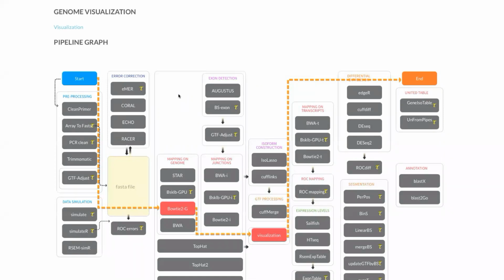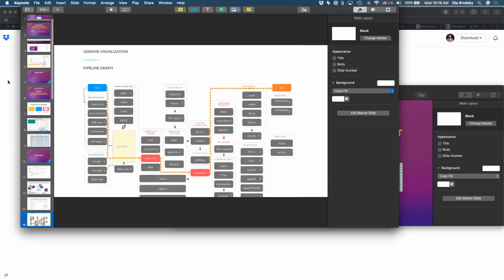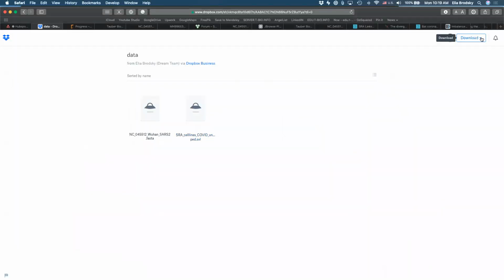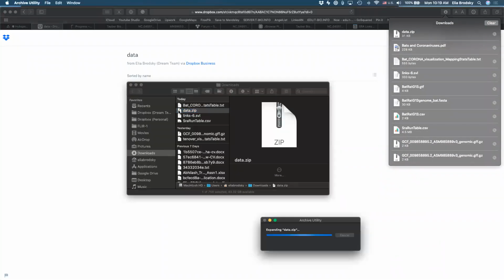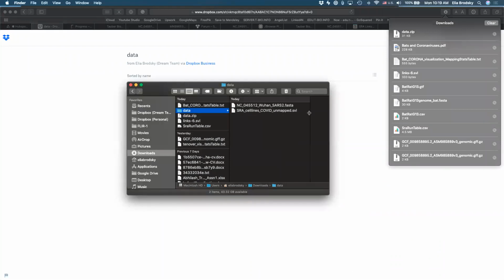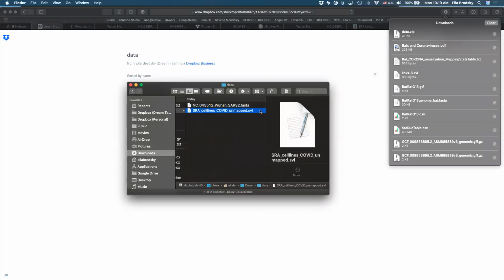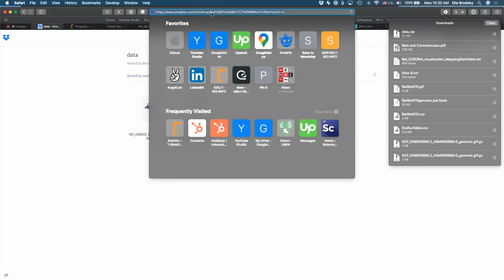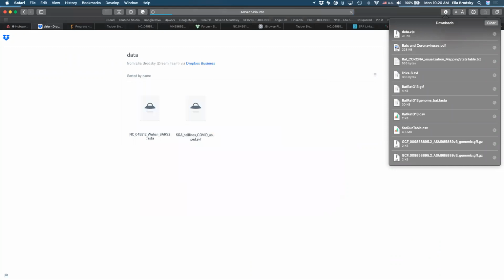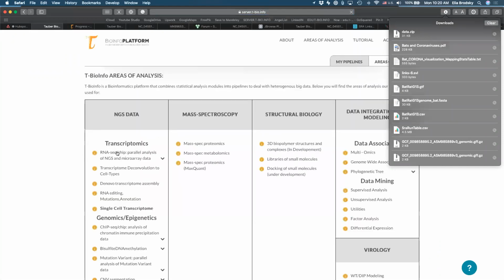So just to understand what is in the unmapped reads, you were supposed to do the following. Let me show you. You download directly onto your computer. Once the files are downloaded, you unzip them. Inside, you have a reference genome and an SVL file. Now, one thing to remember about this SVL file is you have to place it in the right input. So let's go to the platform, and please follow along, and please ask me if you have any questions about what I am doing.